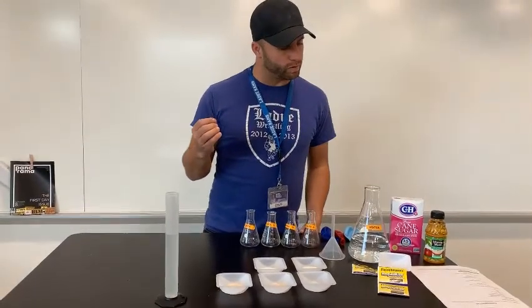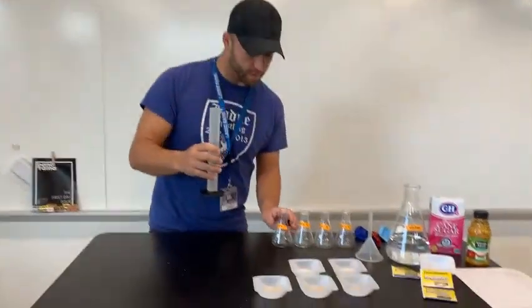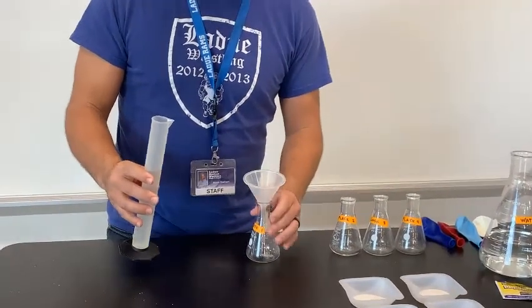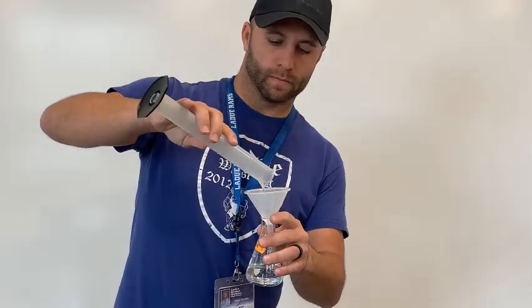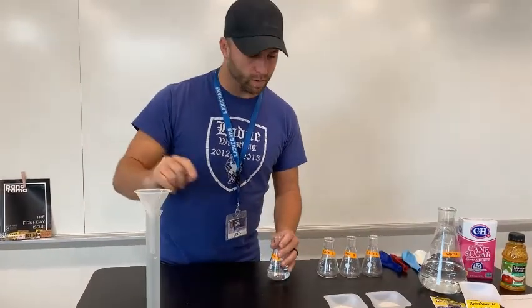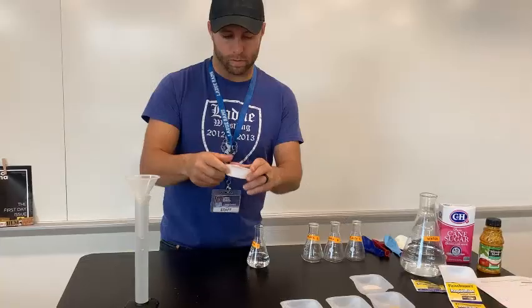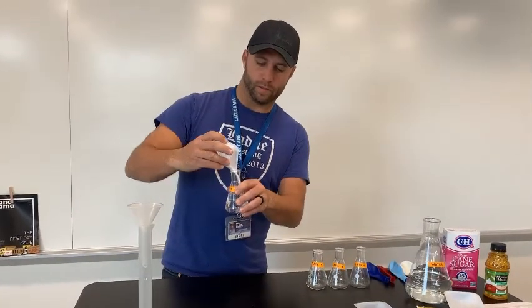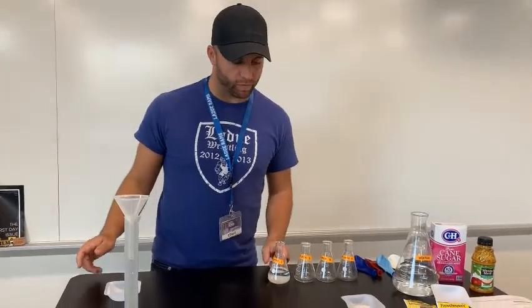Flask one gets 75 milliliters of warm water and 6.5 grams of sugar, which I have already measured. I'll put the water into flask one — for safety's sake I'll use my funnel — and then pour in the sugar from my weigh boat. And that is it for flask one. We're going to move to flask two.